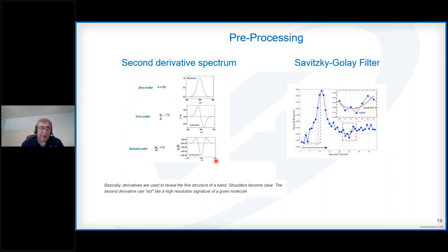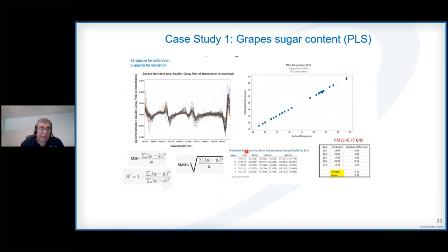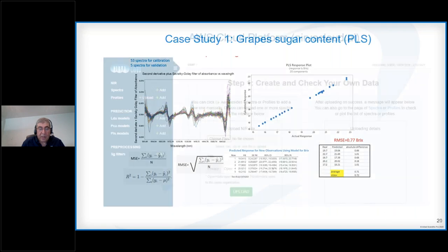For this reason, we normally use second derivative. The second derivative gives us a peak at the same location as the original peak, but in doing the second derivative we also introduce noise. So we use a Savitzky-Golay filter with a particular window to smoothen the noise. I did the PLS modeling in the software Minitab, a statistical software. This is the Savitzky-Golay second derivative spectrum. This is our calibration curve - you can see there are some points missing in the middle. It was not the most complete curve. We did the PLS modeling and got an RMSE of 0.77 Brix, which is not too bad considering we didn't have a complete calibration curve.